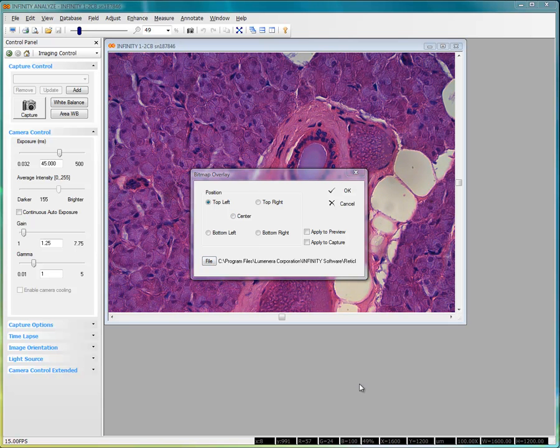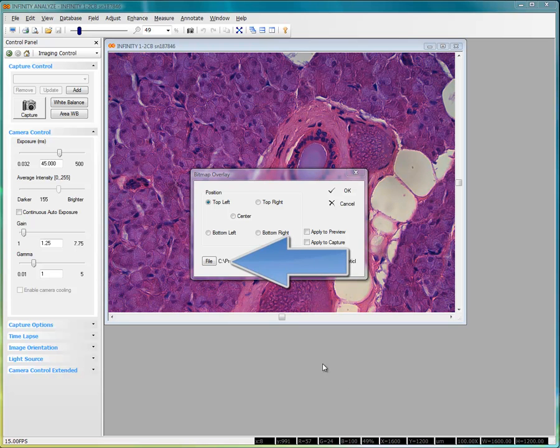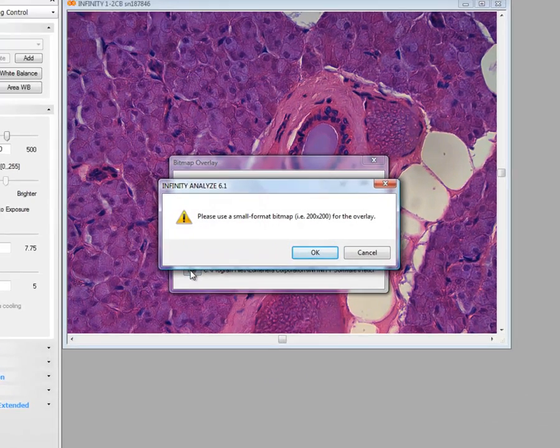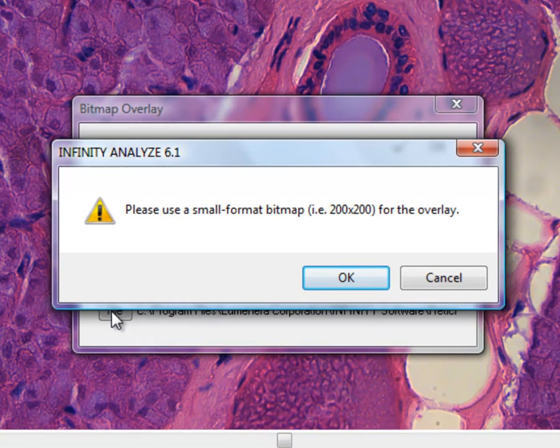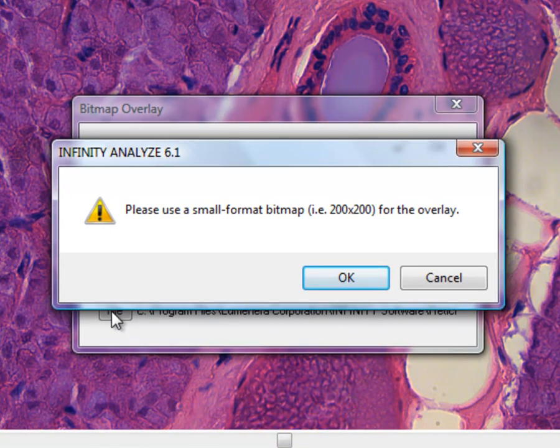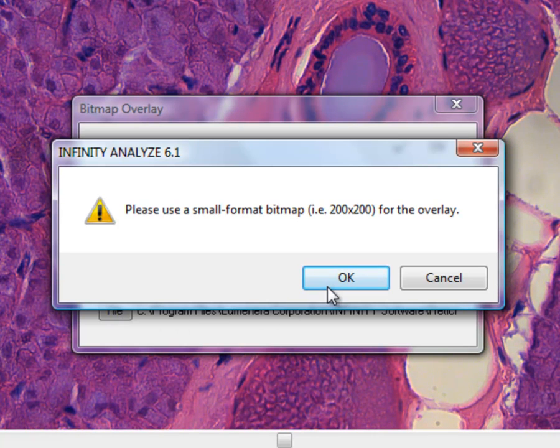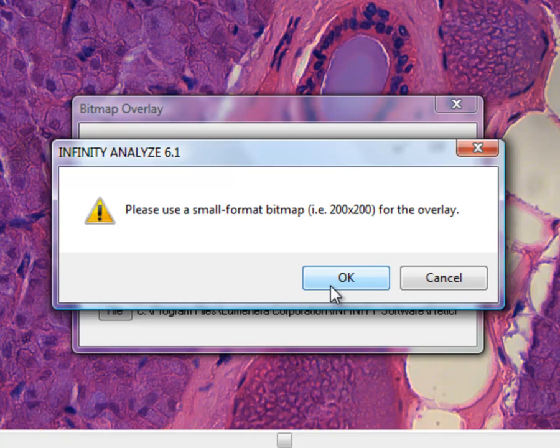Typically, the first step is to locate a bitmap file to use. You access the local drive or network folders by clicking on the file button. A warning message is displayed to recommend that the overall dimensions of the bitmap file be kept quite small to minimize any performance impact.